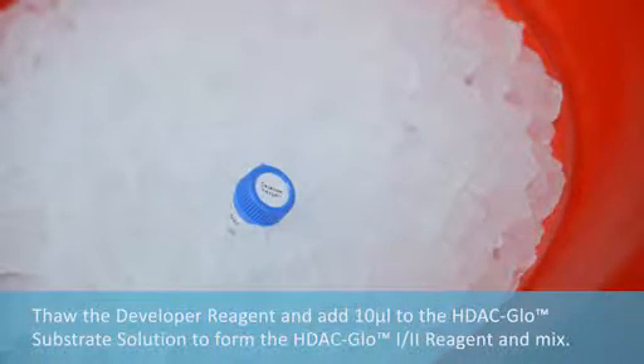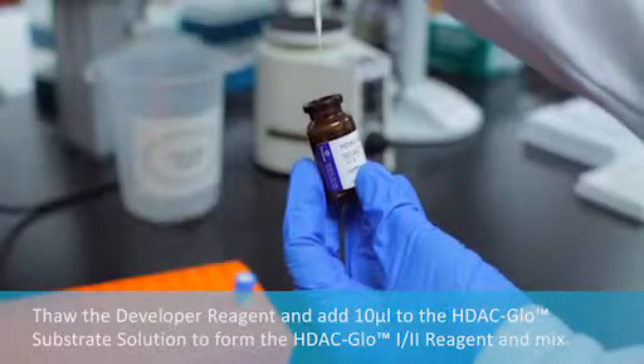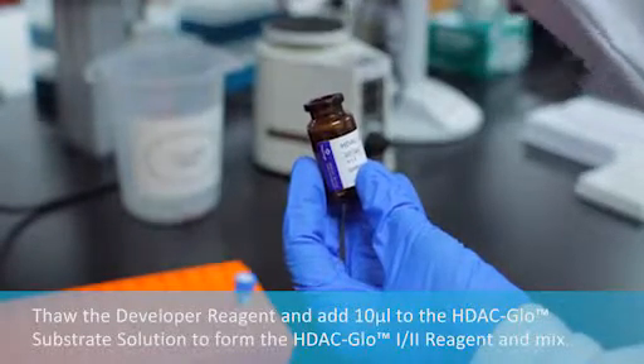Thaw the developer reagent and add it to the HDAC Glow substrate solution to form the HDAC Glow 1-2 reagent and mix.